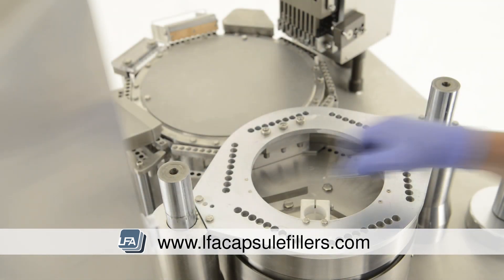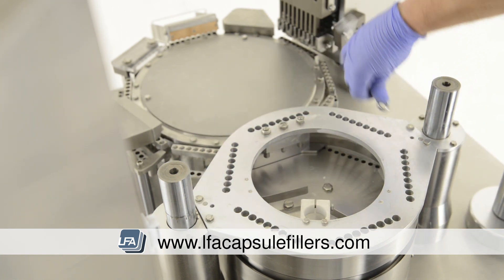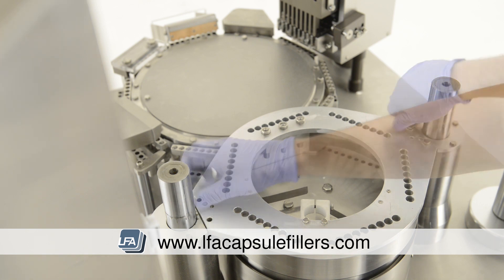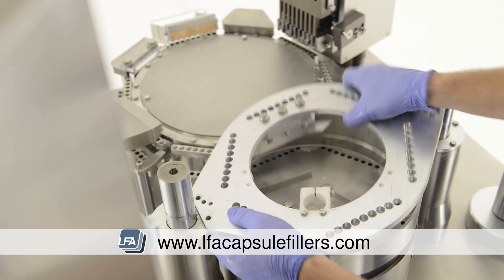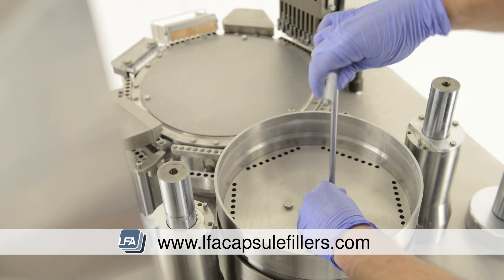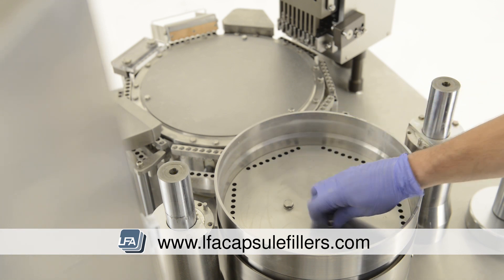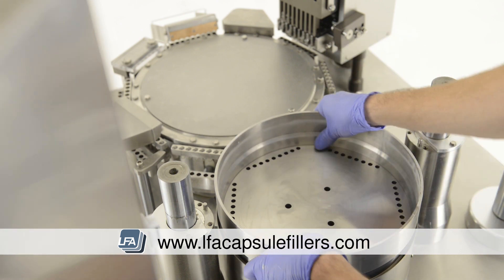The next section down is secured with four 10mm bolts. Take your spanner and remove these, lift this out and place it to one side. The bottom section of the tamping turret requires a special tool that comes with the FACF. Use it to remove the three 14mm bolts, then lift and remove this section.